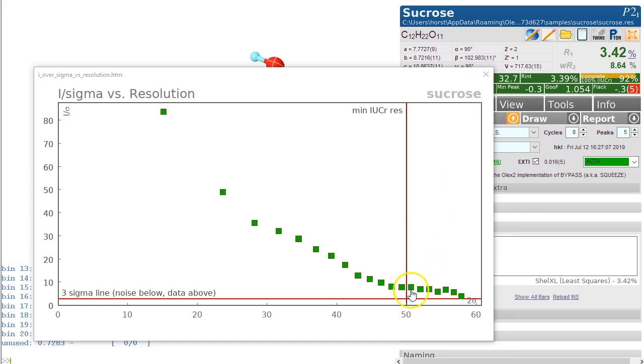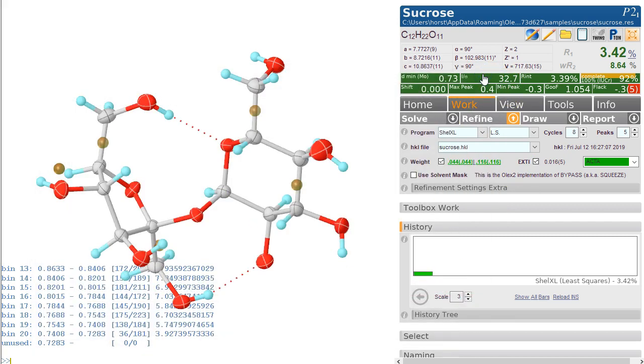I think it's worth including all the data all the way out here because it's above the three sigma line. So we're looking good. Thanks for using Olex2.